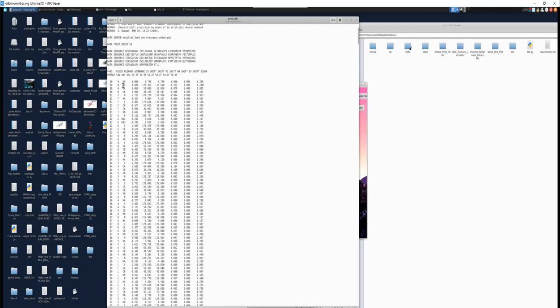So you're going to have an HNCO that gives you your carbonyl chemical shift. You're going to have an HNCA that gives you your C alpha. You'll have an HNCACB that gives you your C beta. And the amide nitrogen and amide hydrogen can come from your NHSQC.